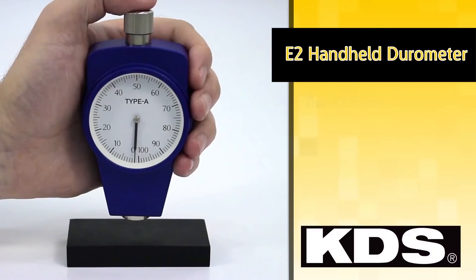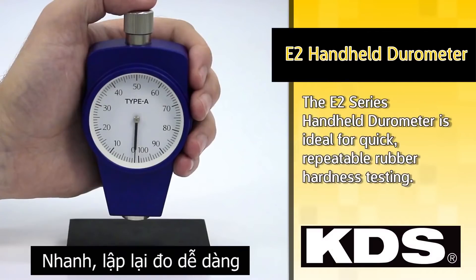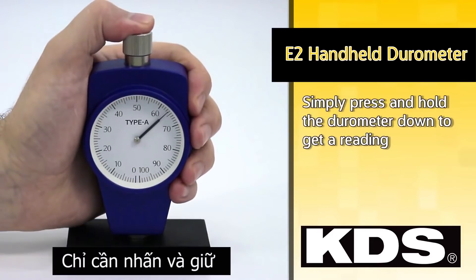The E2 series handheld durometer is ideal for quick repeatable rubber hardness testing. Simply press and hold the durometer down to get a reading.